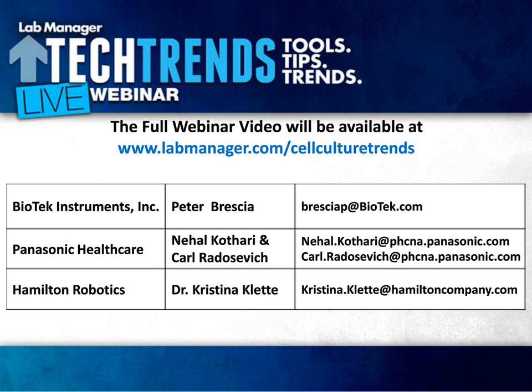If you have a workflow where one of the processes is just confluence imaging from the incubator to the reader, you don't want to have the plates go through the liquid handler for that, because it may be able to do some other process in parallel while your incubator is handling the growth, and then maybe a robotic arm taking plates from the incubator to the reader. So you definitely want to consider your workflow and how the instruments are set up around each other so that you can optimize parallelism as well as timing and efficiency.